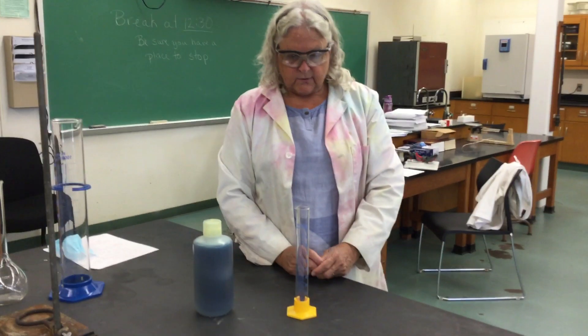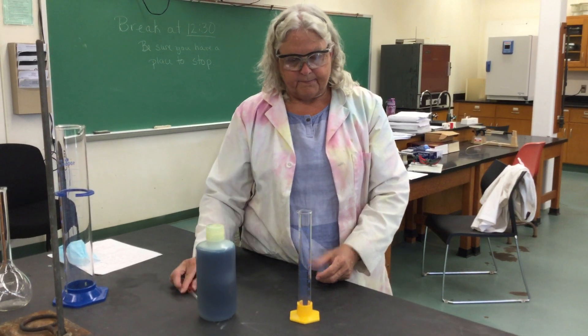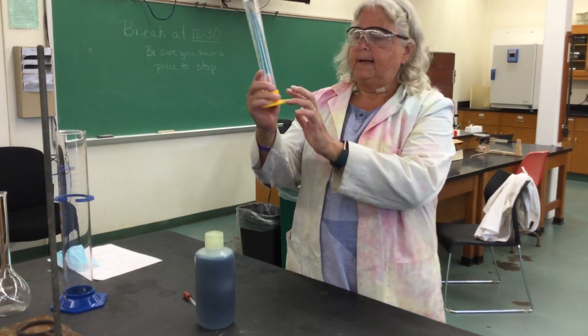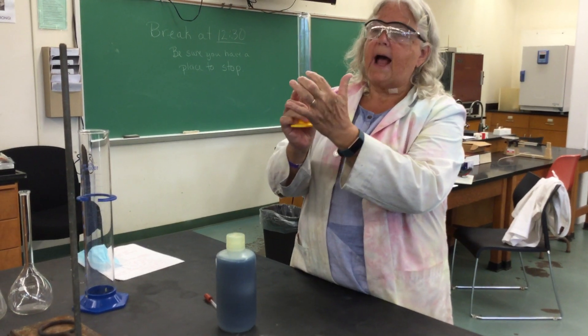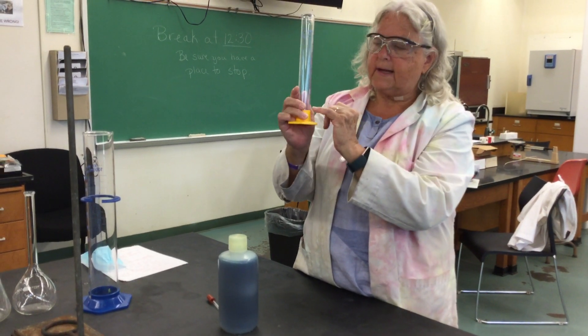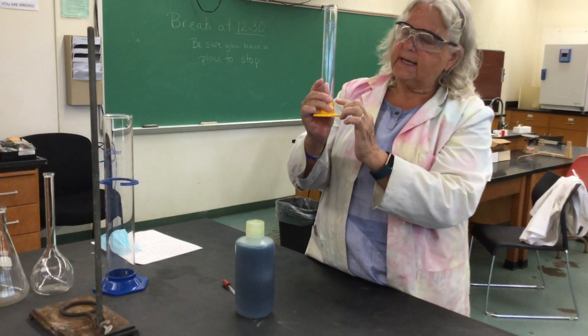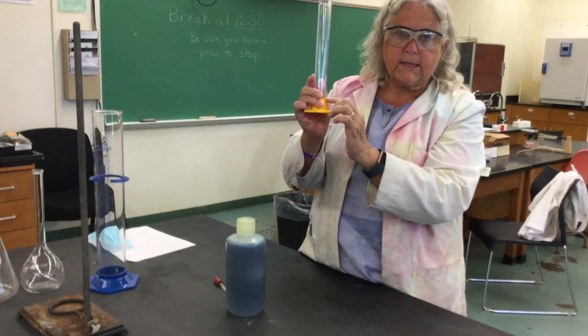We're going to talk about using our graduated cylinder today. In your drawer you'll have a piece of glassware called the graduated cylinder — it looks like this. It has markings on the glassware itself. This one holds 100 milliliters and is marked in 1-milliliter increments.